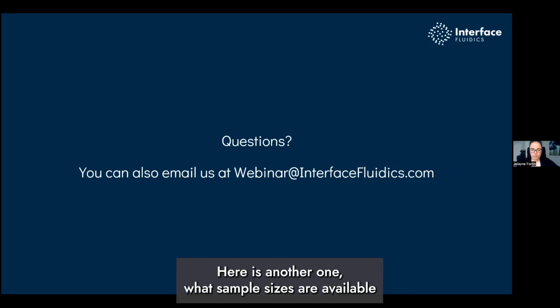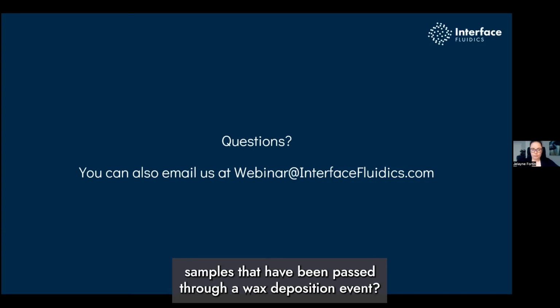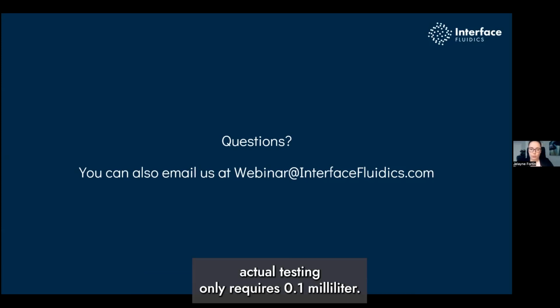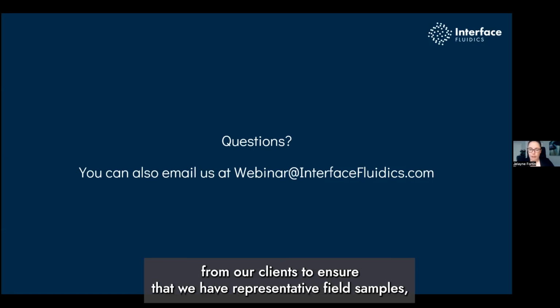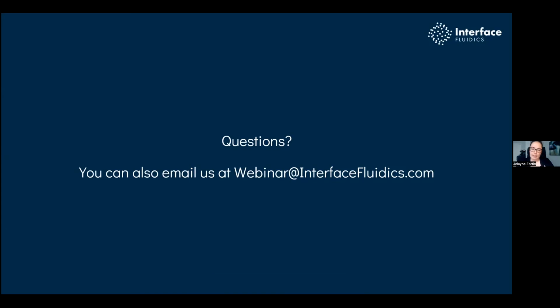Here's another one. What sample sizes are available for wax deposition testing? And can we accept oil samples that have passed through a wax deposition event? Our actual testing only requires 0.1 milliliter. Typically we take about 50 milliliter samples from our clients to ensure that we have representative field samples, and then we can perform a number of subsampling and testing on that.